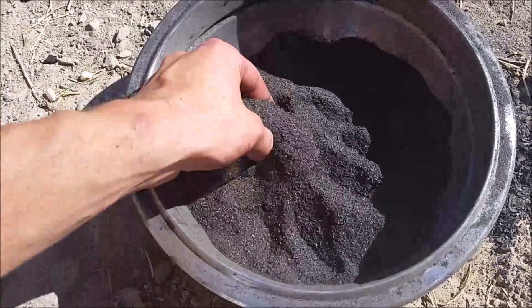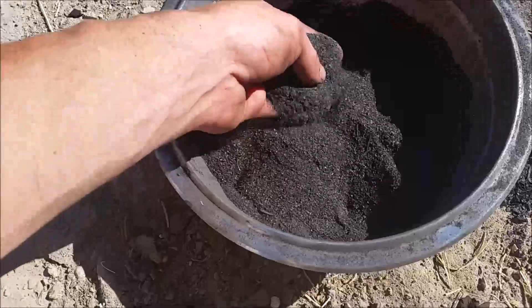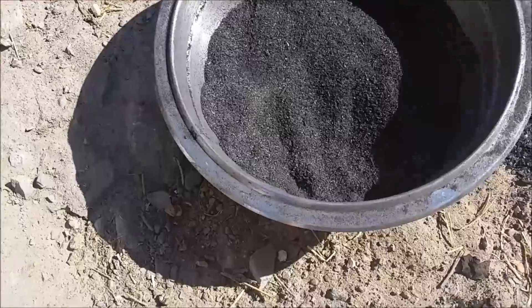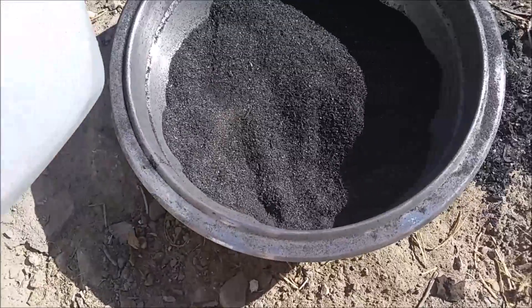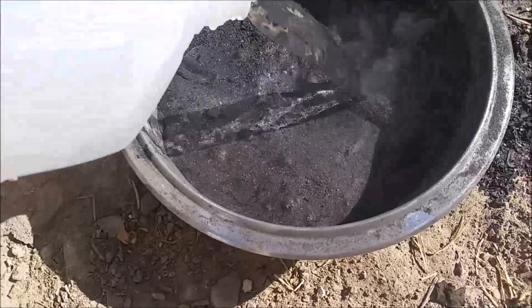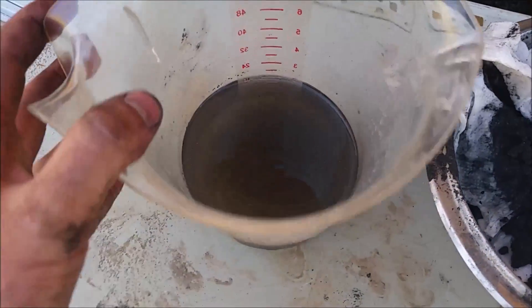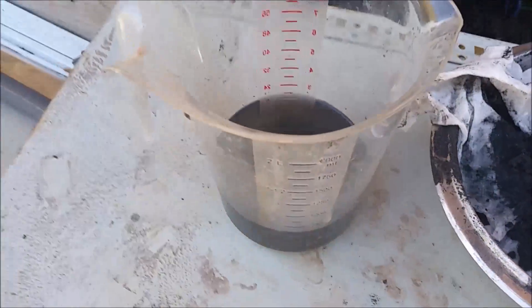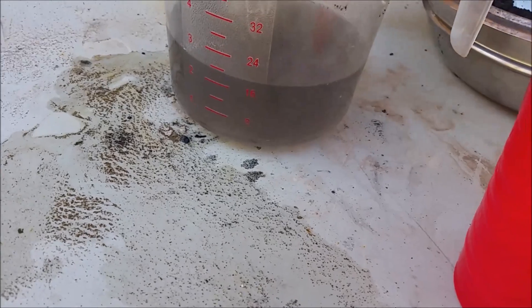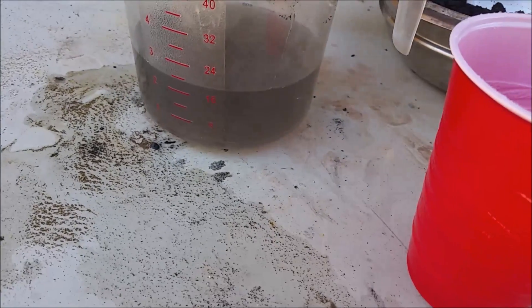The seaweed's reduced down to ashes — they're still a little dark and could burn more, but it doesn't seem to want to burn very well, so this is probably as good as it's gonna get. Let's go ahead and add some distilled water here so we can wash the iodine out. I filtered out the ashes and got something fairly clear. I'll go ahead and let this settle for a while, then take a sample out and do a quick test to see if it's got any iodine.